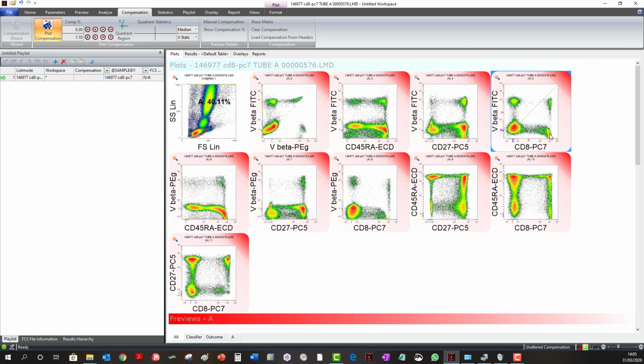The first being to simply click on that population and drag that population upwards. When you release, the data is recalculated and all the plots are updated. Again, click on a plot and drag the population upwards. And one last time, click and drag and release.